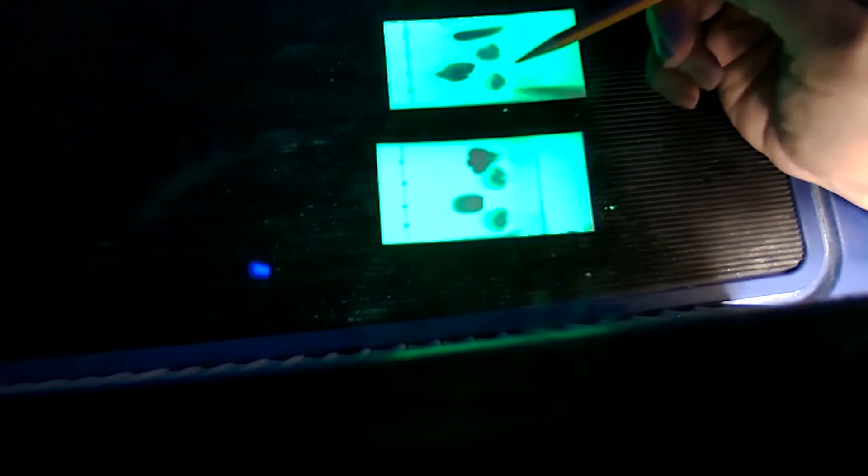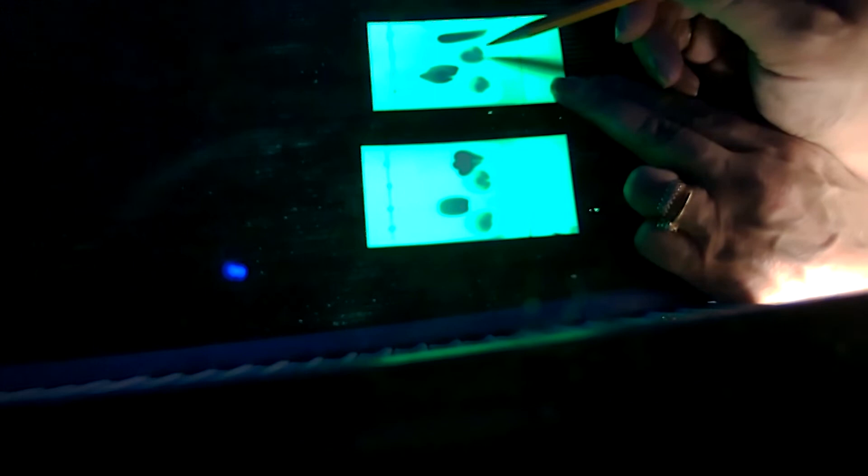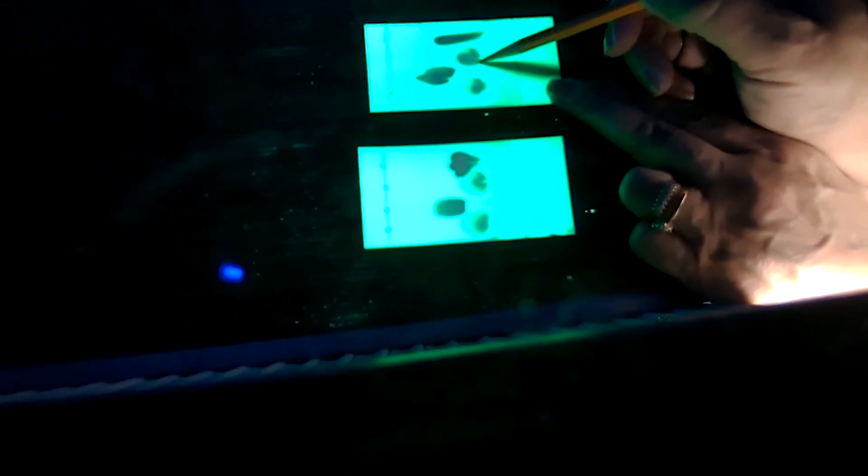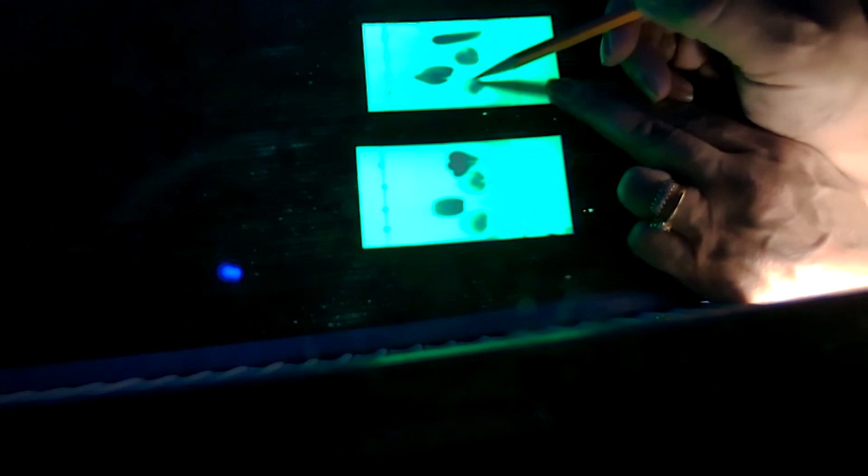And if I take this plate out of the UV lamp, it's not going to show the spot. So I'm going to have to use my pencil here and mark and circle around the spots here.